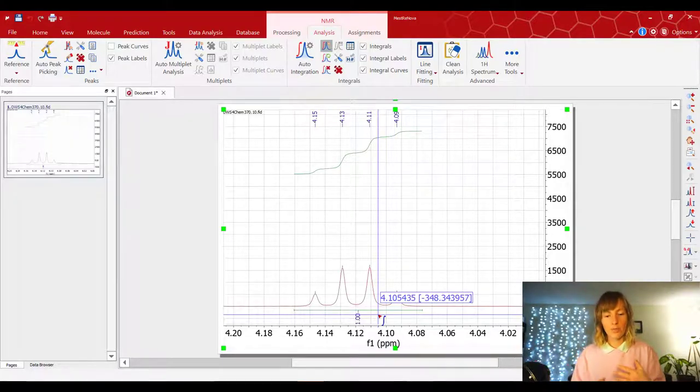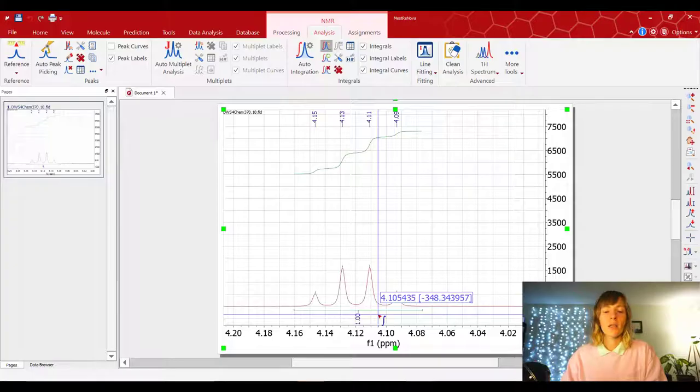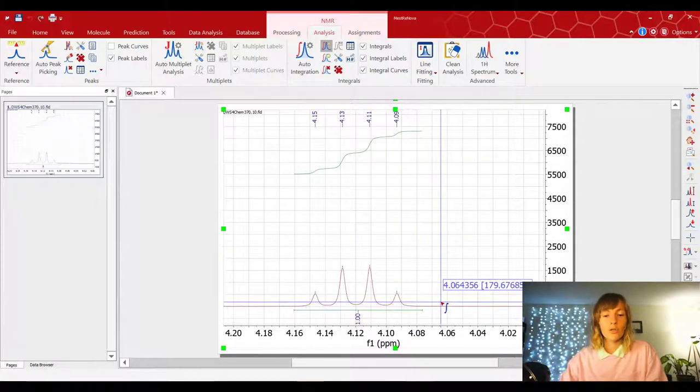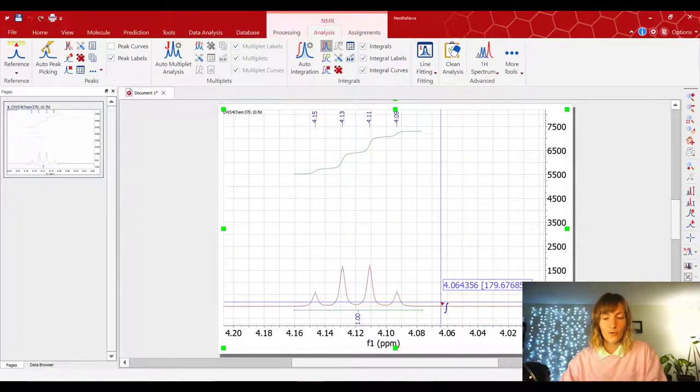And it automatically is going to integrate your first selected peak. Your first integrated peak is going to be automatically set to one. And then you can kind of play around with the numbers if they don't make sense. So after you integrated the first one, you need to integrate the rest.